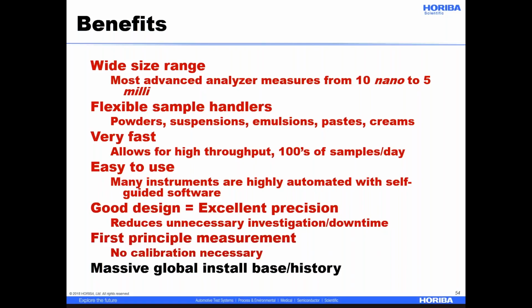And it's a first principle measurement. Unlike microscopy, where I have an artifact and I compare the artifact to my sample, and here artifact refers to a reticle or some sort of calibration standard, laser diffraction depends on the wavelength and the geometry of the instrument, both of which are extremely stable. We really just use the polystyrene standards as checks on instrument performance. So if I put something in and I get the wrong answer, it means I made the sample wrong, or there's something wrong with the instrument, and we can go and fix it. And there is a huge global install base and history of laser diffraction. So as you start doing more work in particle analysis, you'll find that most people know about laser diffraction as a technique, and so it's a language many people understand. And again, that ties back to some of these earlier discussions.